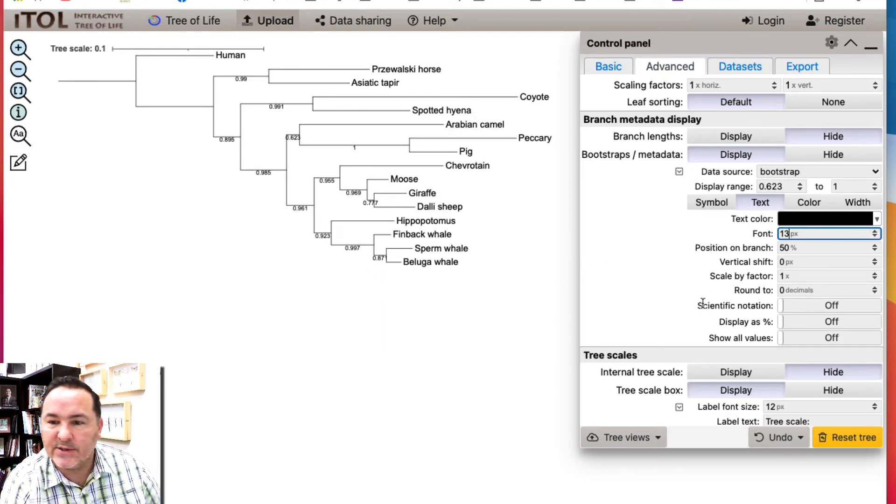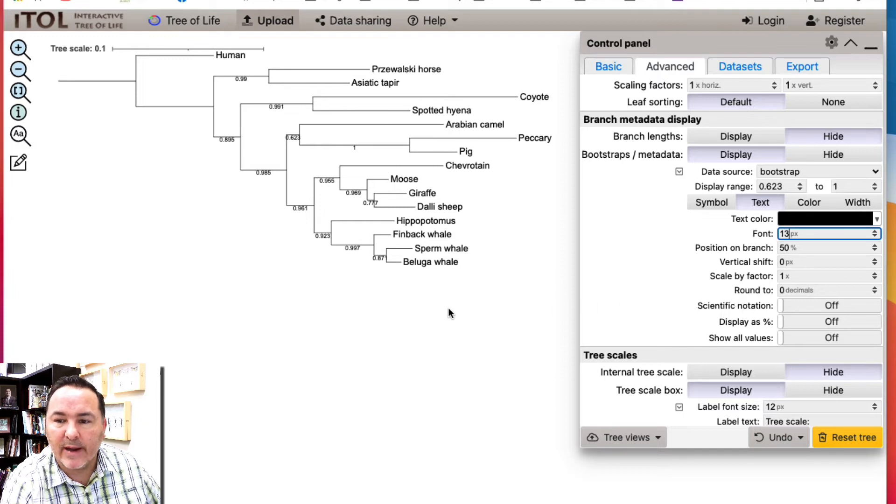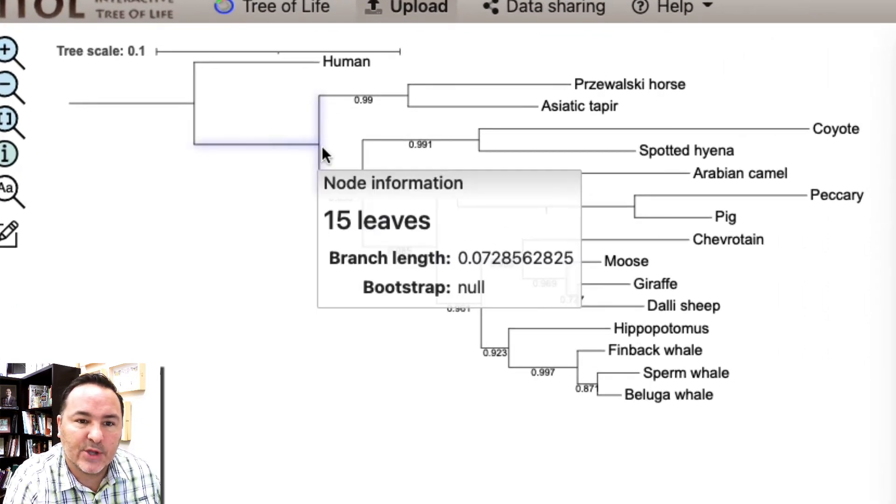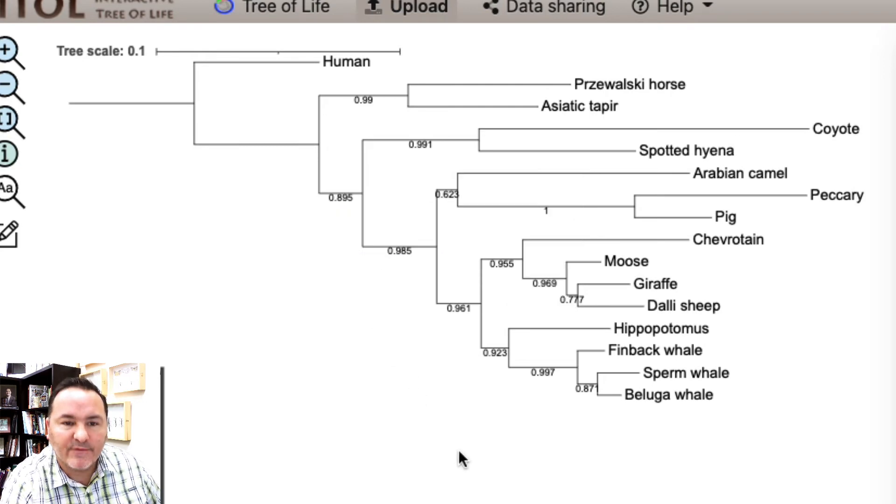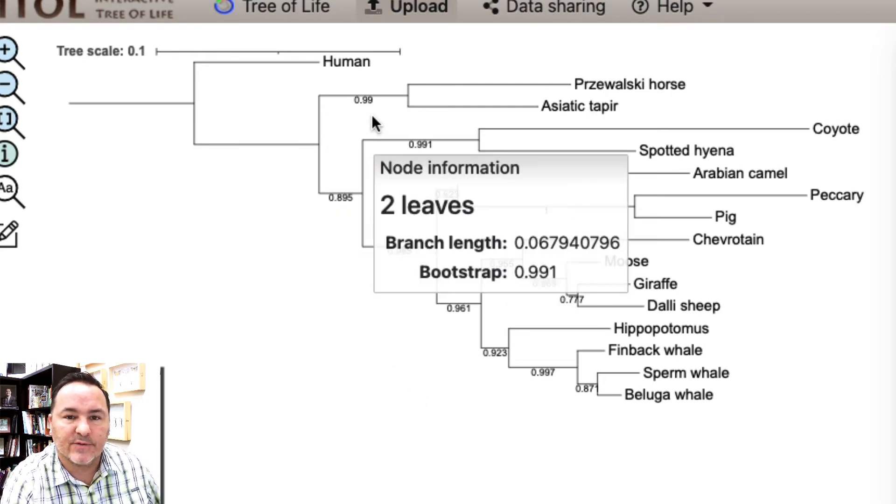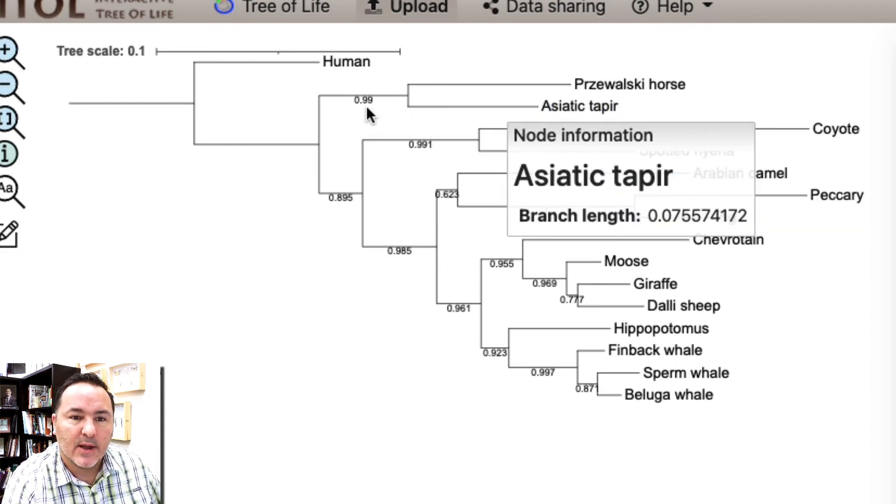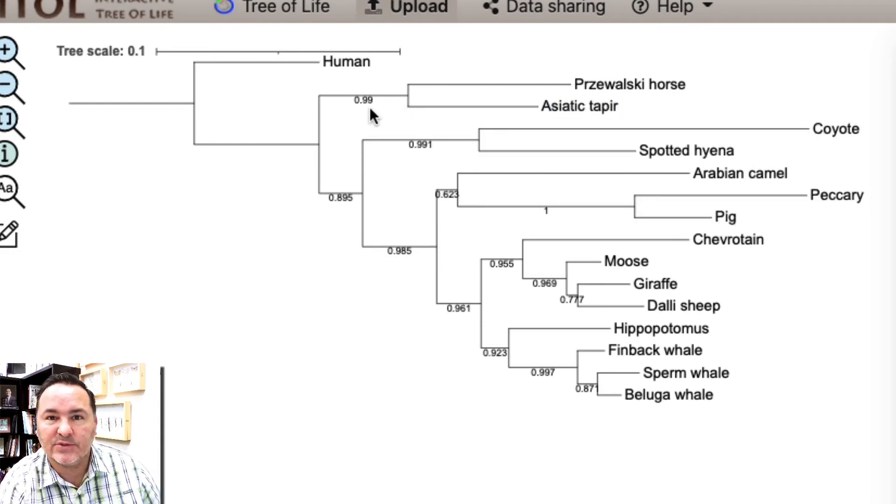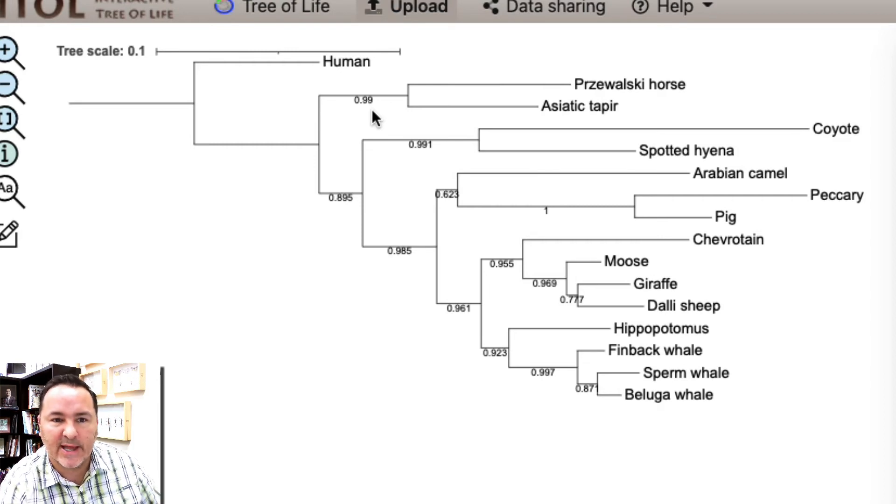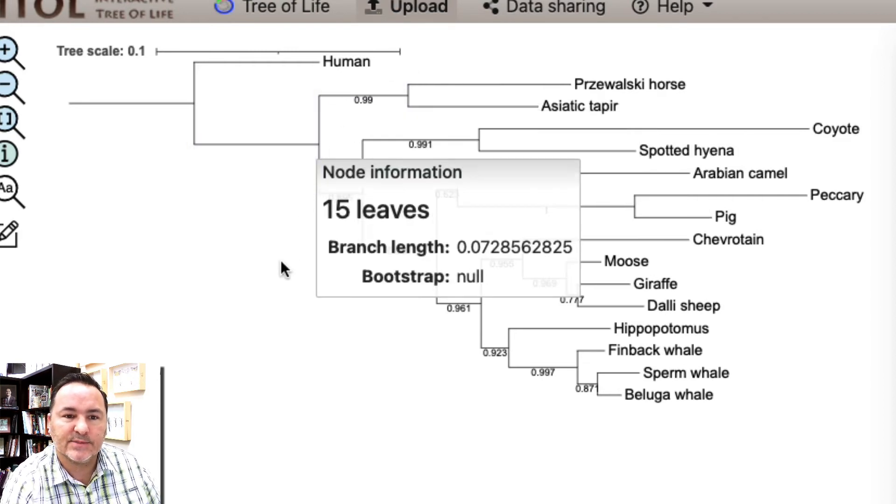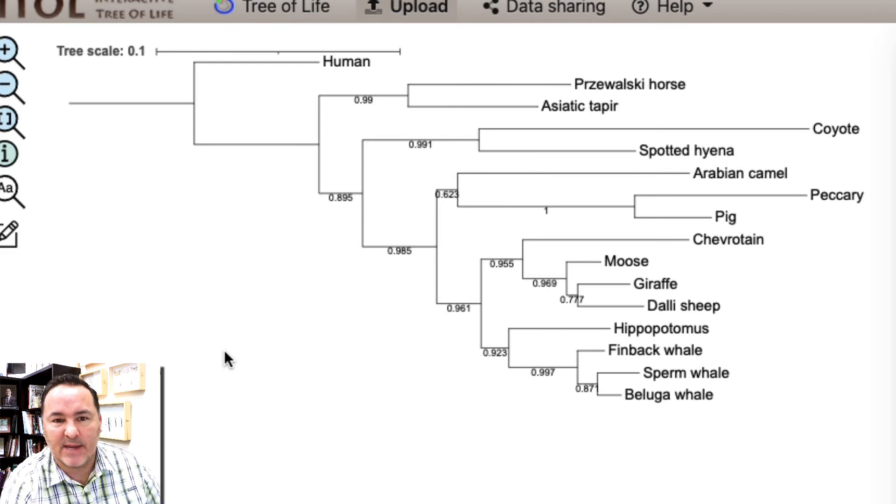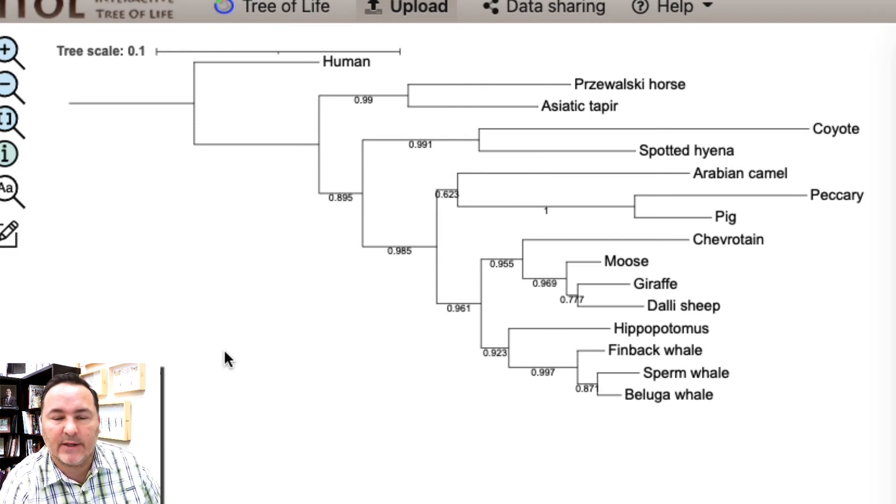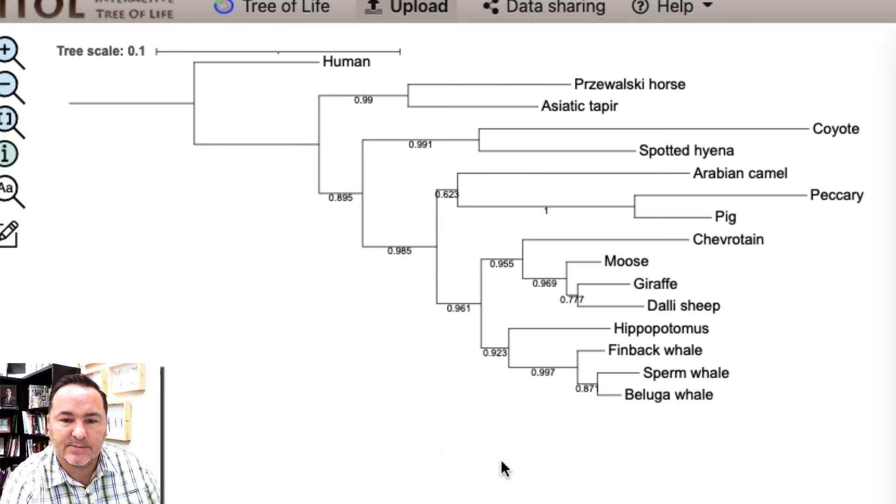These are in a percent value right now and that shows the confidence that I have in the relationships of those nodes. For example, the horse and the tapir, 99% of the time that it ran the bootstrap test or this nodal support test, these two organisms were found themselves on the same node. So you can be very confident in the relationship of those two organisms.